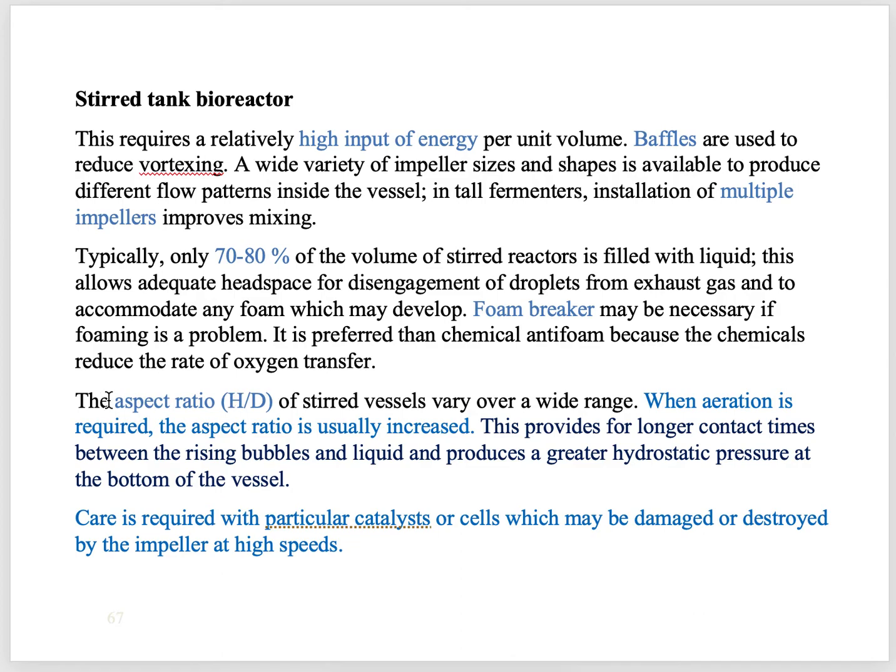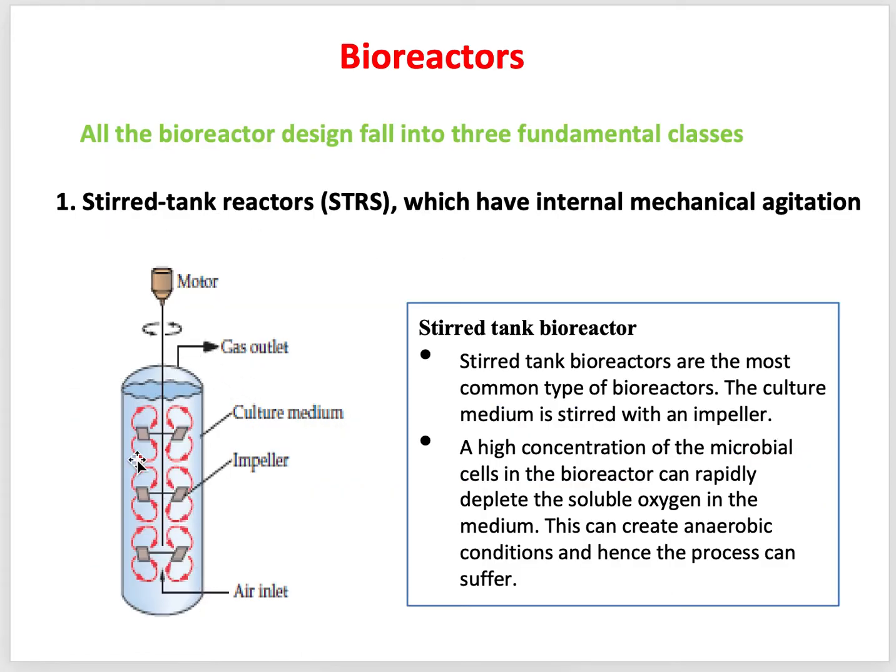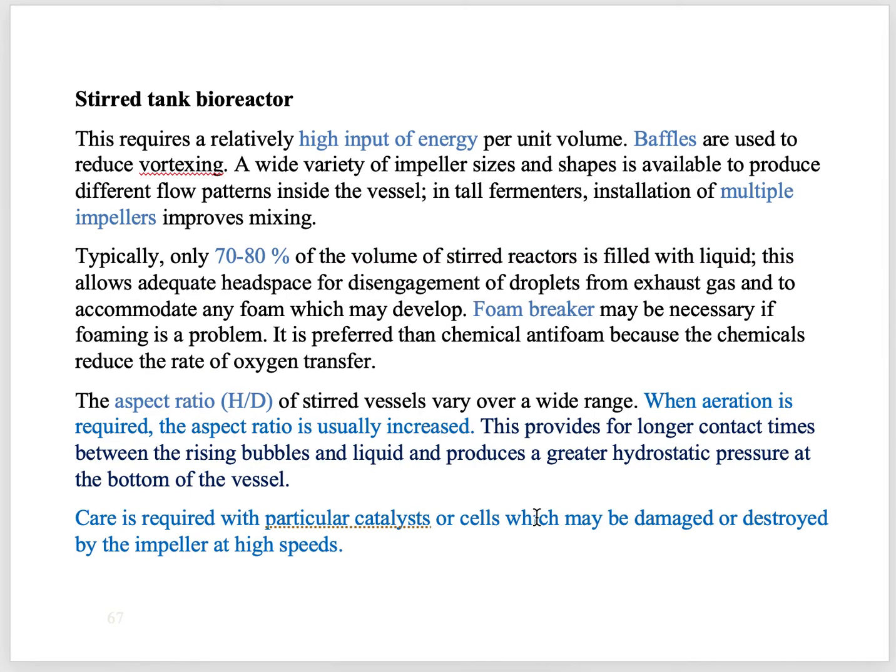Then aspect ratio. Aspect ratio means the ratio between the height and width. The aspect ratio is important for proper mass transfer. Usually, what aspect ratio we need to use depends on the type of process that we will do in that fermenter.